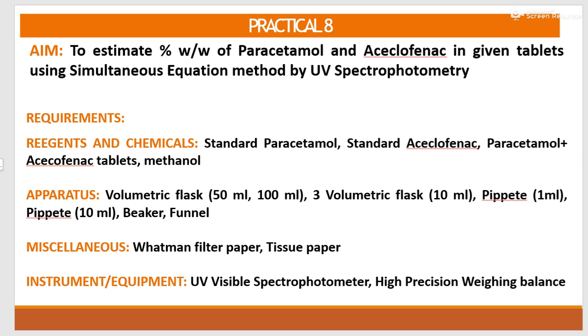You require standard paracetamol, standard aceclofenac, paracetamol and aceclofenac tablet, methanol. The role of methanol is to dissolve standard as well as sample. So it is a solvent.